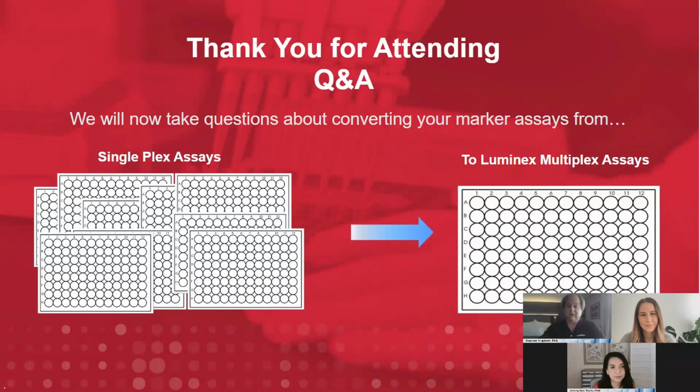was flabbergasted. And even though they sometimes have more markers in the assay than you might want, that actually gives you more information and can help you discover new things that you didn't know before by having certain markers in there that you weren't normally looking at, and you see changes which could be important for the type of work you're doing.